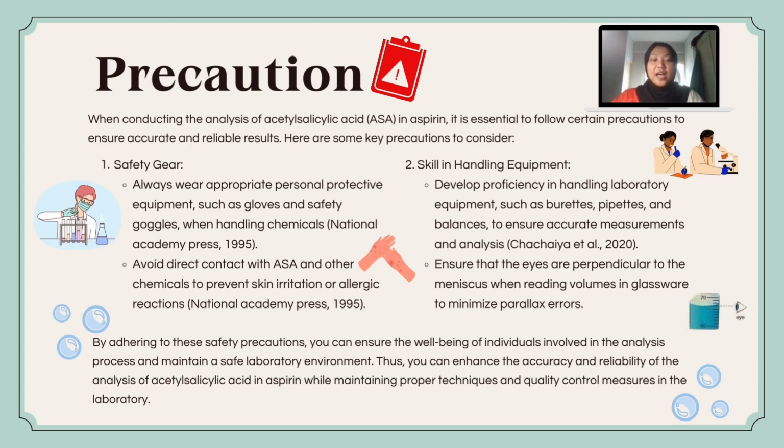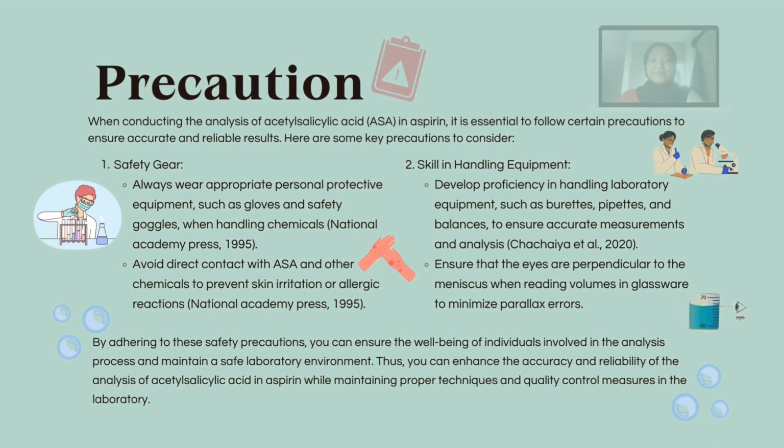Thus, you can enhance the accuracy and reliability of the analysis of acetyl salicylic acid in aspirin while maintaining proper technique and quality control measures in the laboratory.